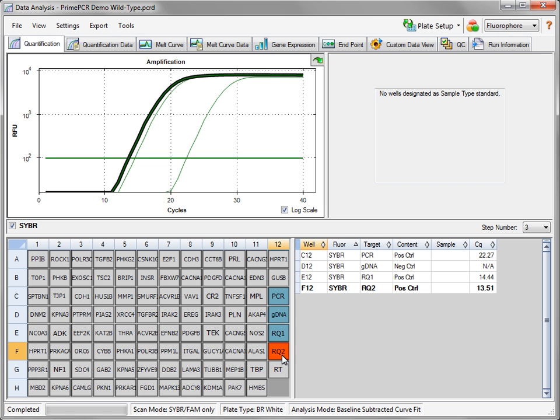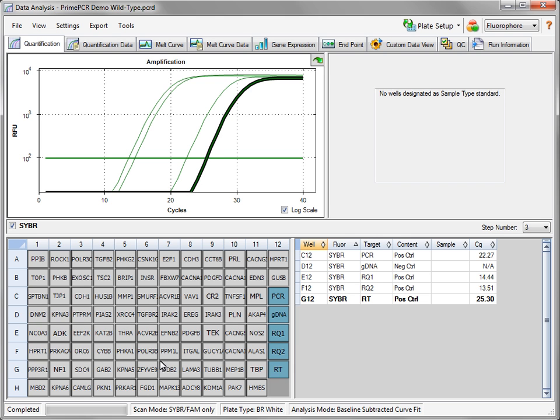The PrimePCR Reverse Transcription Control Assay is designed to qualitatively assess the performance of the reverse transcription reaction associated with a single sample. The assay may also be used to compare the relative performance of the reverse transcription reactions associated with different samples. For more information about PrimePCR controls, consult the PrimePCR Instruction Manual.